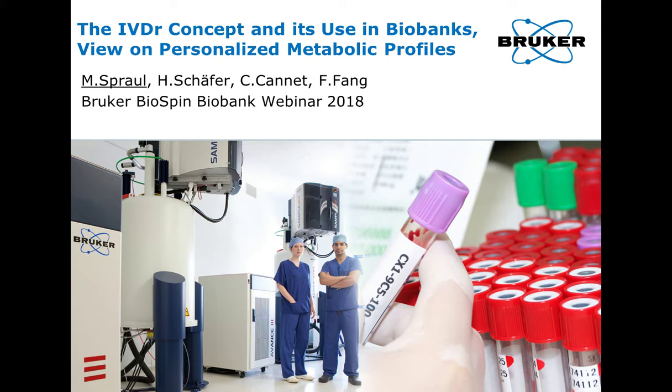So let me just switch. I want to talk about, first of all, the platform concept that we are using in NMR, which is helping especially for biobanks, as I hope you will see in a short while, and also show you a few examples for what you can do with personalized metabolic profiles.